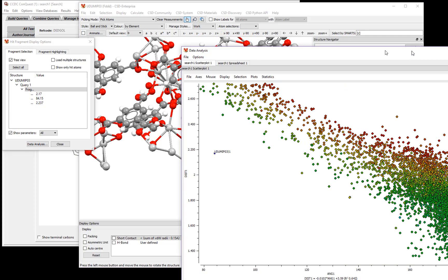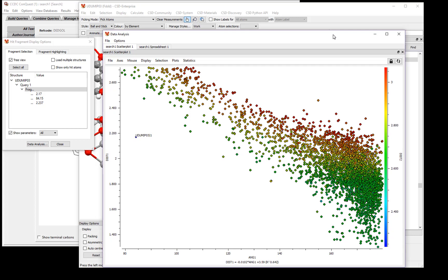Hopefully this has shown you a little example of how to add 3D information to your substructure searches in Conquest. For more information, please see our website or workshop materials.